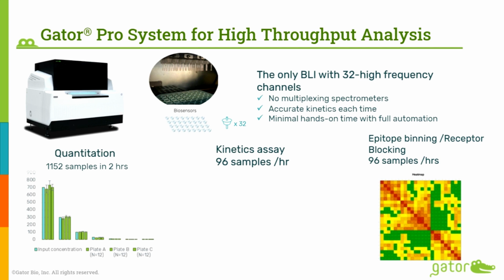So for all the assay setup and everything, of course, you can use a liquid handler as well. That helps you pipette and makes it even more fully automated. That way you don't have to spend that much hands-on time.